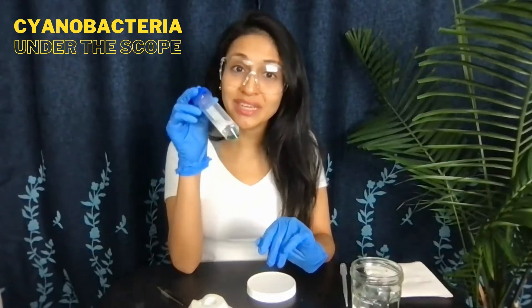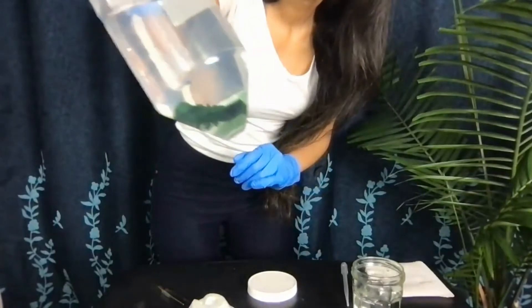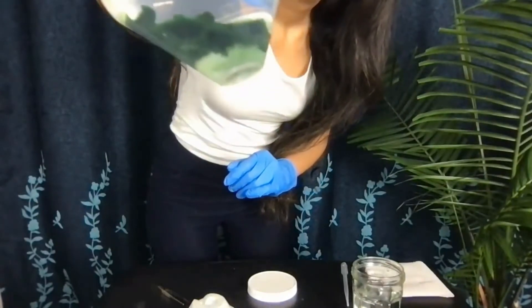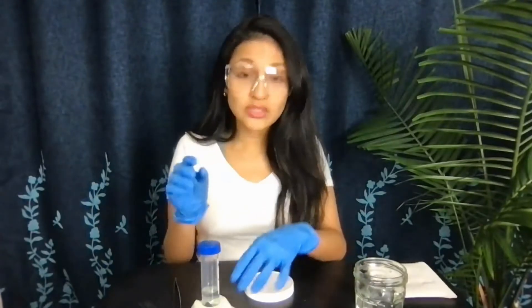I have some really cool cyanobacteria that looks like green algae, and I grab a chunk of it. What I want to do with this sample is get the smallest thread possible. It's okay if you don't know if it's a cyanobacteria or a green algae — there's also different kinds of algae like red algae. That's what we're going to find out with a microscope.